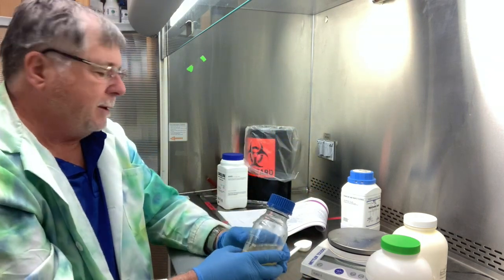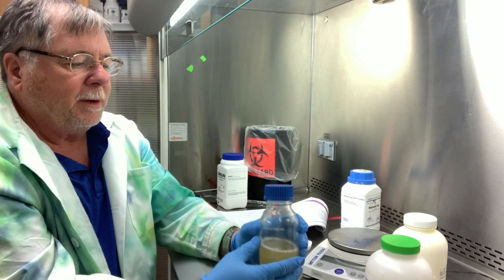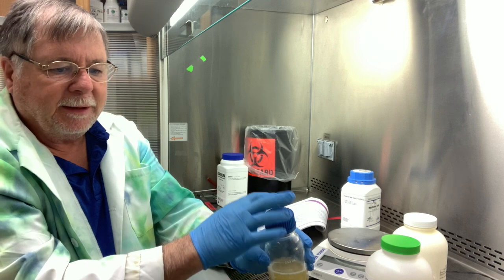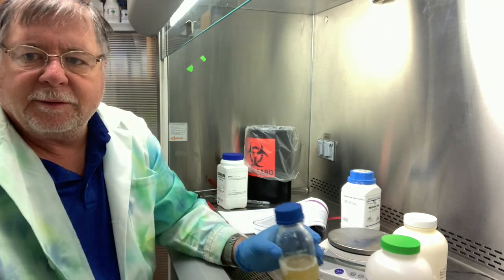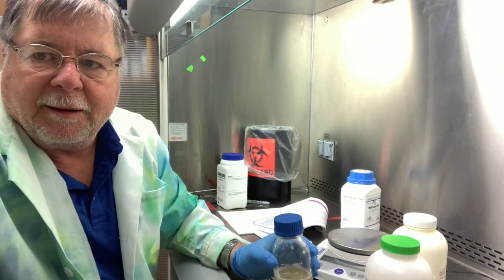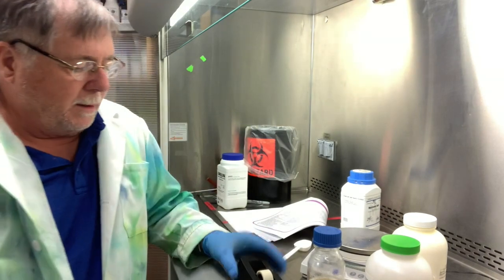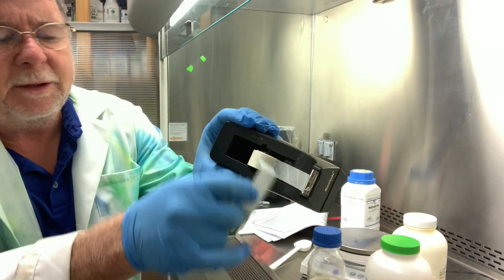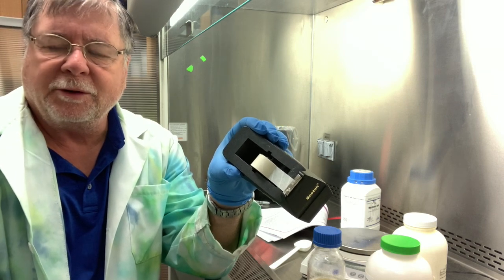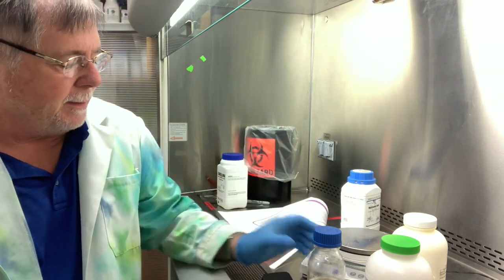Okay, a couple other things we need to do is put on a piece of tape that says what this is. And then we put on a piece of autoclave tape, a different type of tape. It has an indicator. And autoclave tape is going to change color once it reaches the proper temperature and is sterilized. I'll go get it. Okay, so this is the autoclave tape. You see those white diagonal lines? When it reaches the proper temperature for the amount of time, it will turn black. And then that's a way to tell that it's been autoclaved and sterilized.